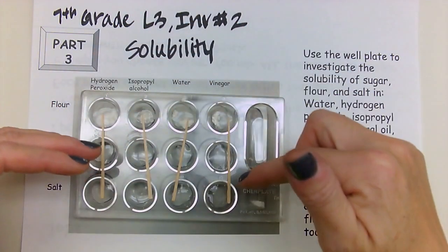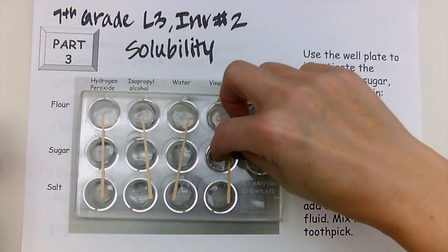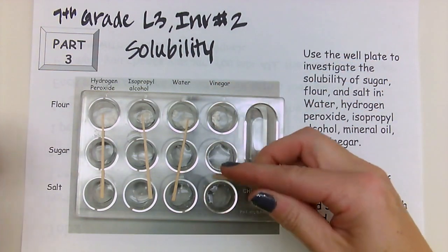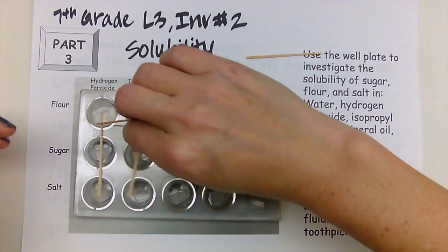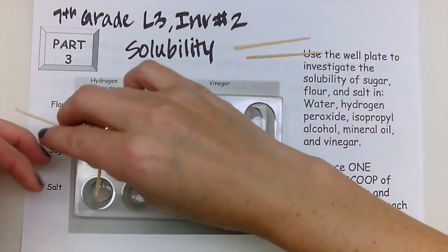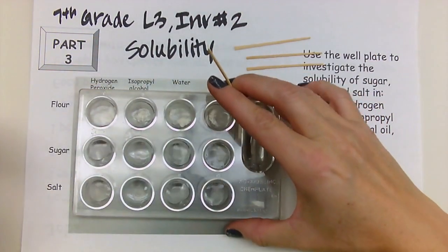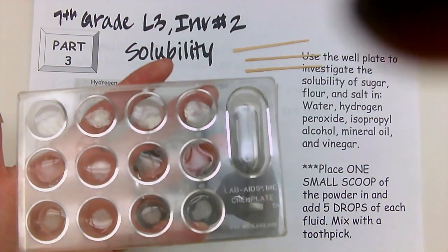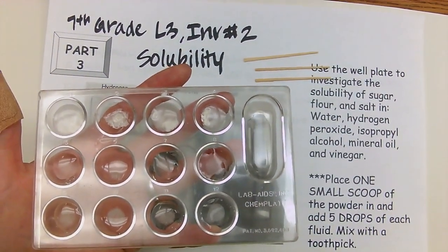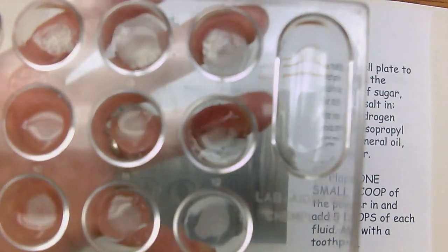Okay, this is the procedure. So person number 1 can take the vinegar and they can stir it. Okay, I'm going to remove these so we can see what's going on here. Okay, so this is the vinegar, if you don't remember. And let's get a little closer.